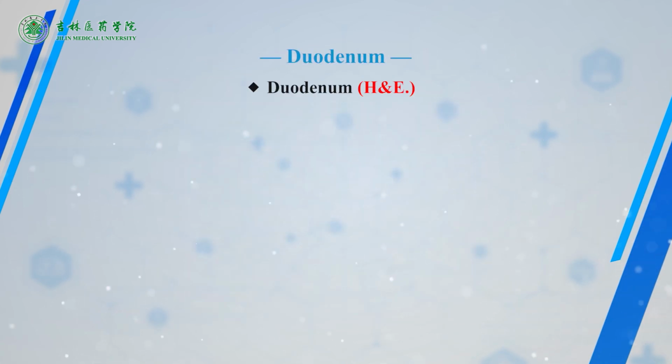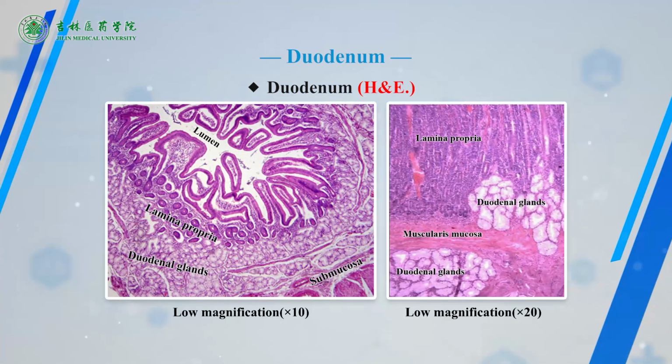The fourth slide, duodenum. Obtained from the cross-section of duodenum, H.E. staining. The luminal surface stained purple-blue is the tunica mucosa. The mucosa projects many delicate and strap-like blue processes named intestinal villi into the lumen. In some places they protrude into the lumen, forming plicae circulares.